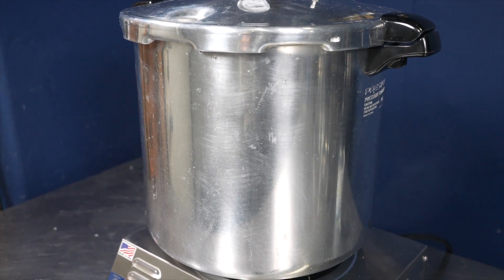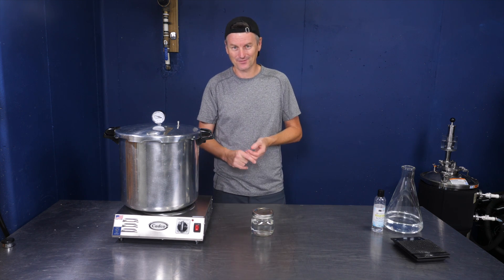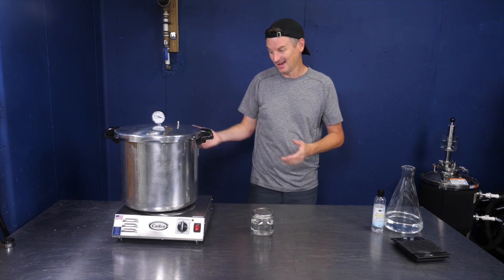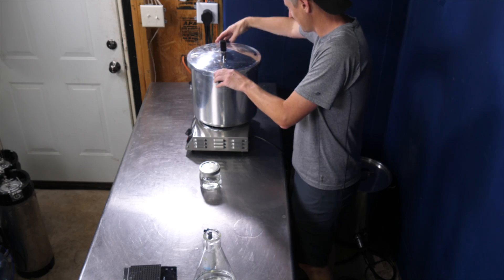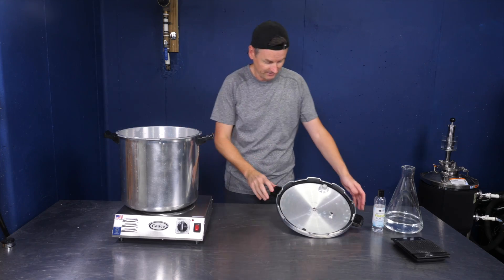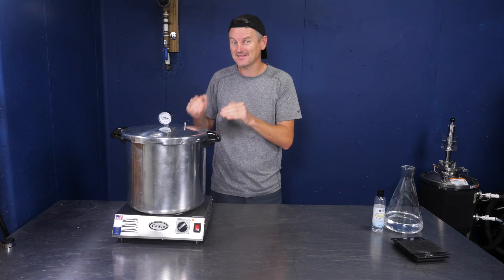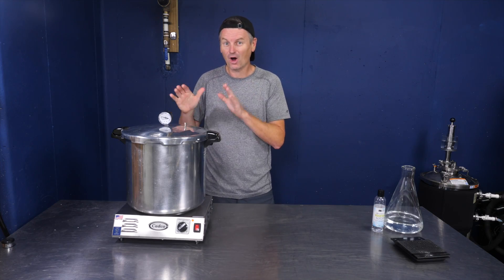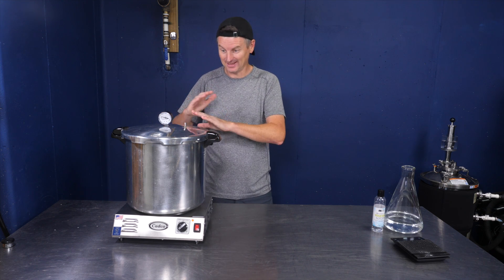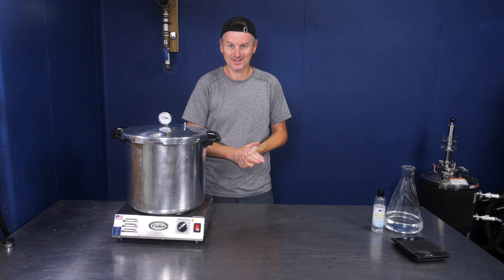I picked one up for about a hundred bucks on Amazon, which is kind of a lot if you're just using it to freeze yeast. But I also use this for my yeast starter process as well. I'm going to put this in here — I already have some water in here to create some steam. I'm going to heat this up, get it to 15 psi and hold it for 10 minutes. Once it's done that, I'll let it cool back down to ambient temperature, and then we can move on to the next stage.